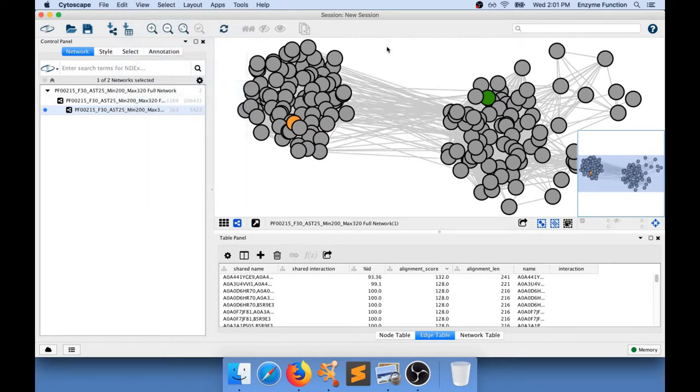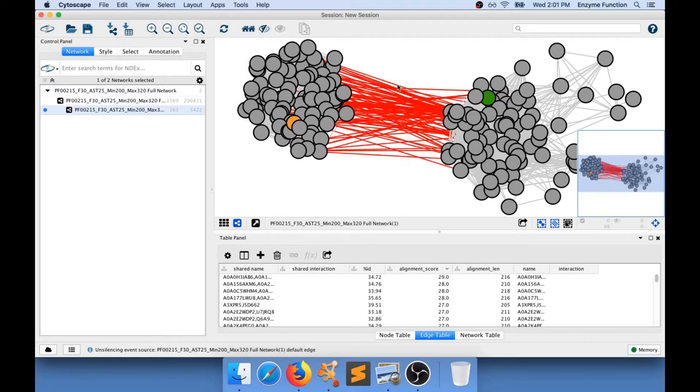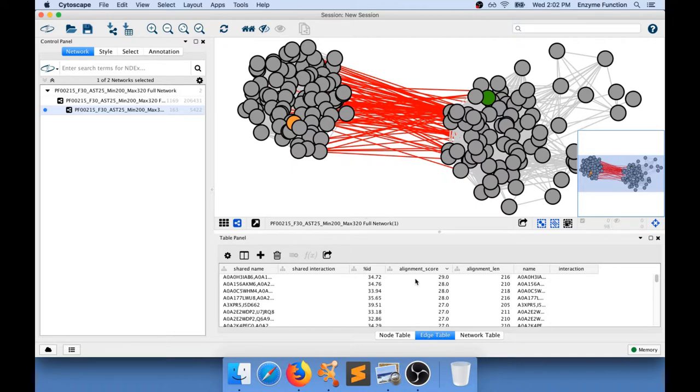So I'm going to do undo delete. What I wanted to do is really examine this value, identify the alignment score 29. And this is the lowest value that I will have on my network that allows to connect these two sub-clusters.